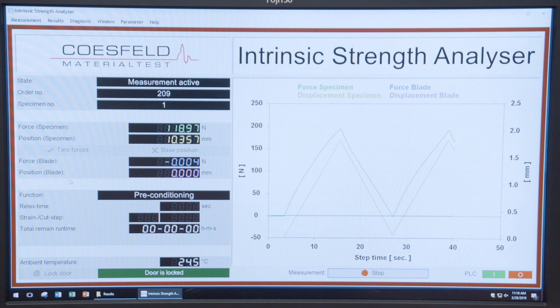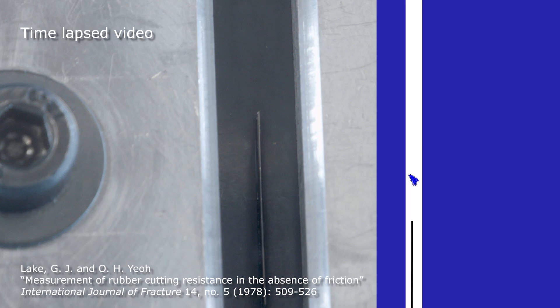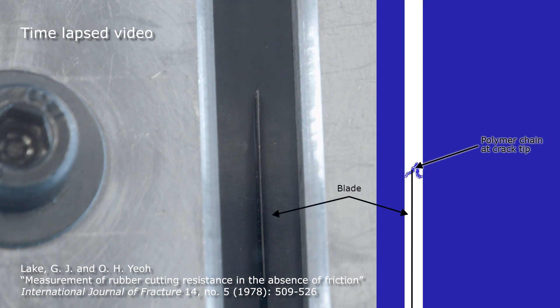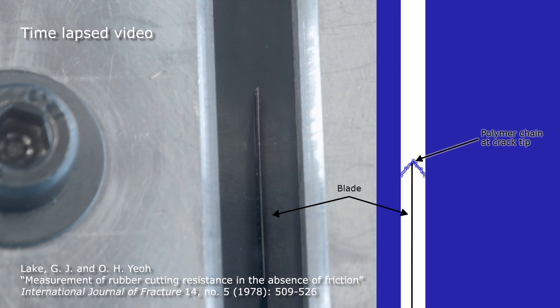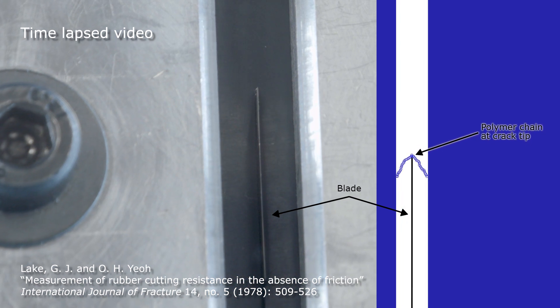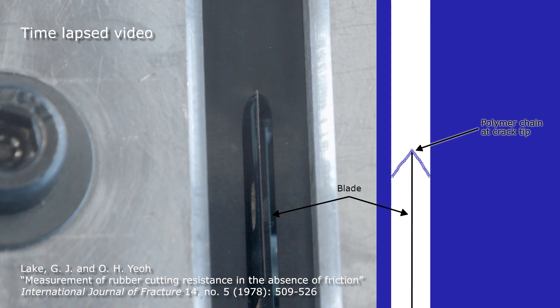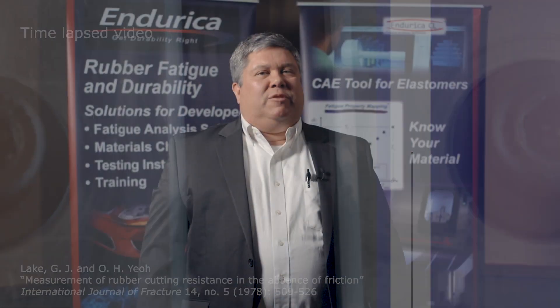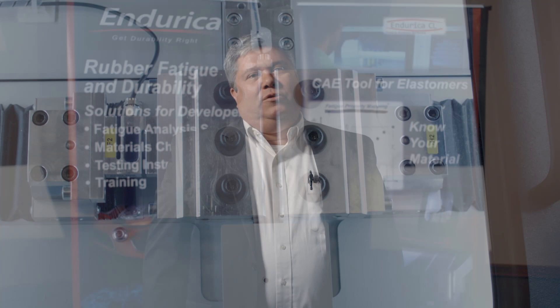The intrinsic strength analyzer uses the Lake and Yeo cutting method. The core idea of this method is that a sufficiently sharp blade can directly load and break molecular bonds without inducing the large viscoelastic process zone and losses that arise when you drive a crack by applying ultimate loads or dynamic loads.